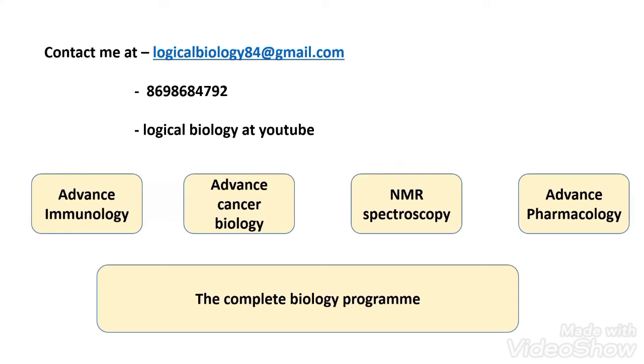Parkinson's studies? When people are working on anti-Parkinson compounds, we can check the effect of these drugs on the membrane potential of glial cells and neuronal cells, and we can find out the presence of particular ion channels and neurotransmitter receptors on the cells before and after treatment.